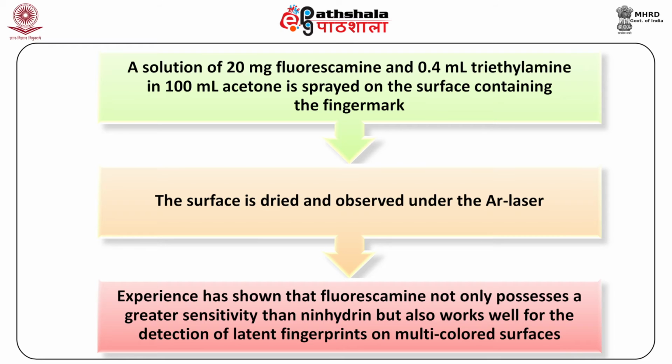The surface is dried and observed under the argon laser. Experience has shown that fluorescamine not only possesses a greater sensitivity than ninhydrin but also works well for the detection of latent fingerprints on multicolored surfaces.